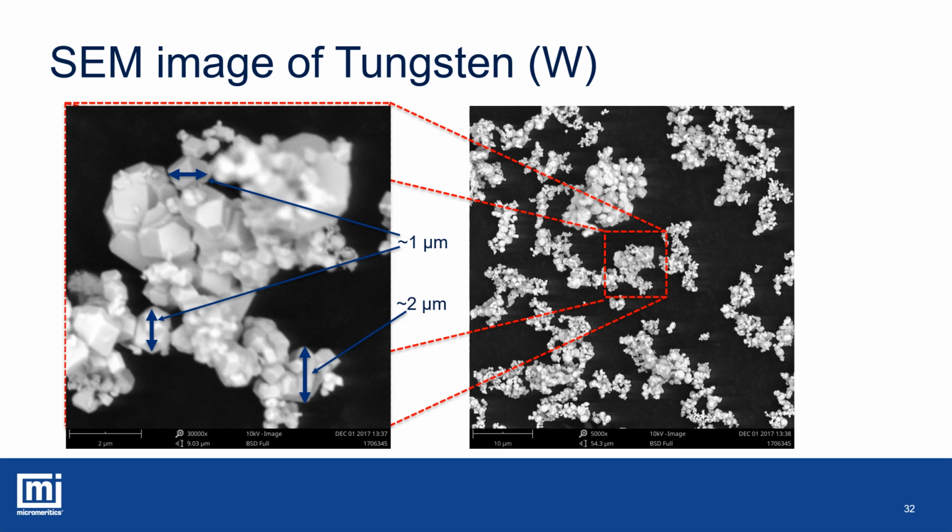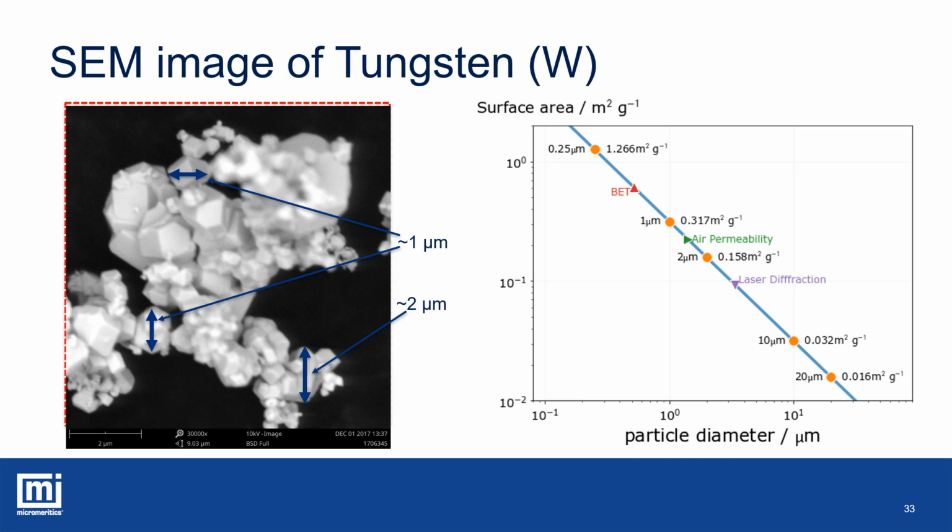For this image, we also made some surface area calculations using the density of the material and the inversely proportional relationship between surface area and particle size. And again, using that calculation, we established the same trend where as you decrease in particle size, you increase in surface area.